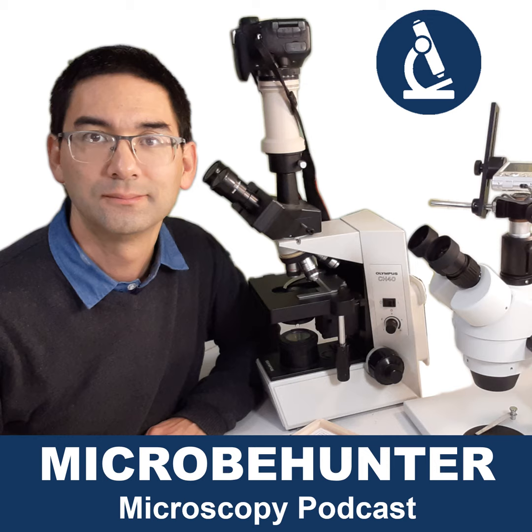And for this reason, the microscopic check, so to say, has to be at the very end of a sequence of tests, where you've already ruled out other possibilities, and not at the beginning where you try to confirm a theory that you already have. Maybe it is correct, but we don't know for 100%. So this is a little bit the issue that I'm having here.